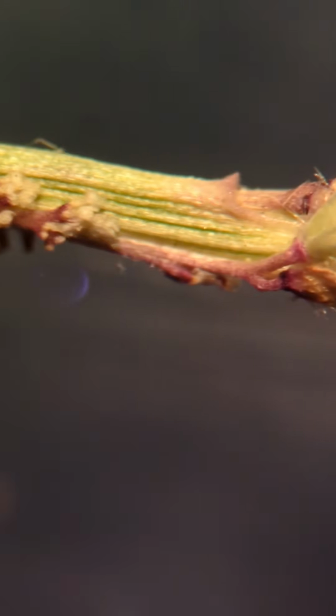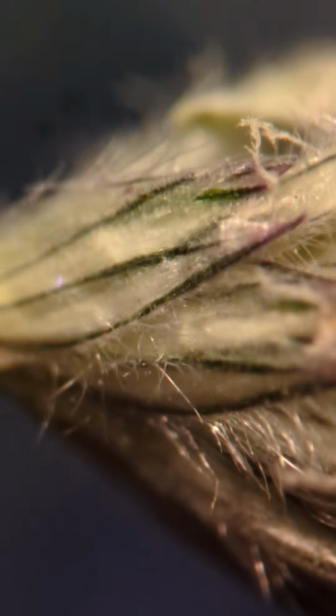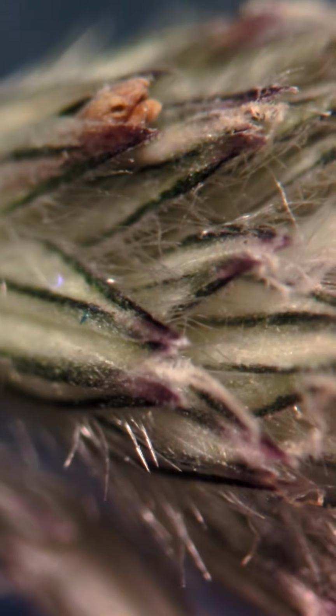Like, whoa, what is that? I don't know if that's a fungus or something. There could be mycorrhizal symbiotic relationships going on there with a lot of plants. That's the case. And every single one of those kind of looks like corn a little bit, right?